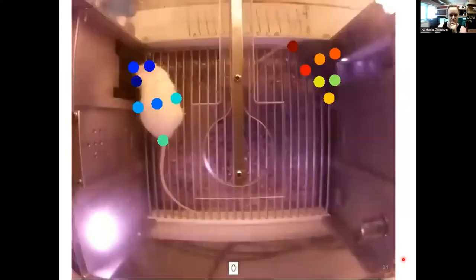And then for trying to figure out what is good enough, DeepLabCut has a lot of different performance metrics, and I think so do the others. I always think that it's easiest to just start by watching these videos. And so this will play a couple times through. And what I'm looking for specifically is how much these points are moving back and forth. So how much jitter there is, if they're swapping places at all, if they're swapping between animals, and then if any of them disappear because they're low probability.